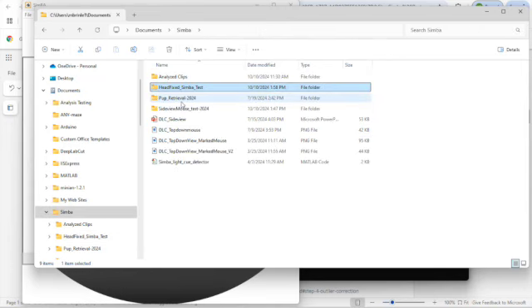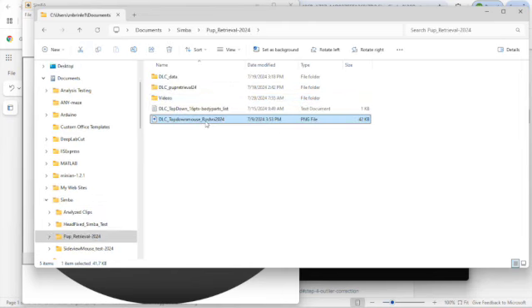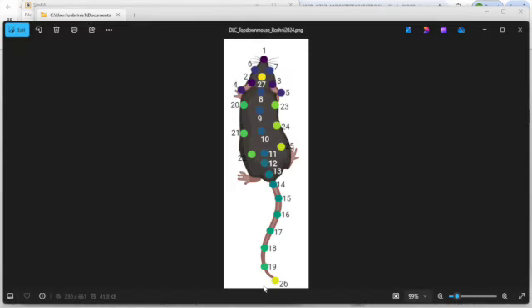An example of this for the top-down view, which might be a little bit easier to grasp, is this image here. And so it doesn't matter if it's a cartoon or if it is the actual mouse. It's just something I think that SimBA uses to show you what the body part configuration looks like.